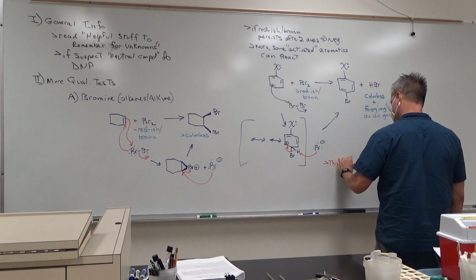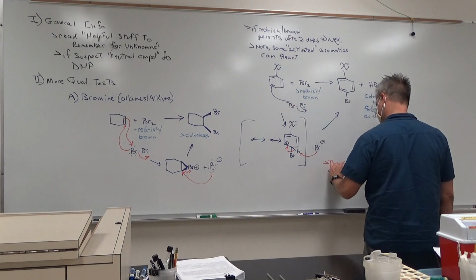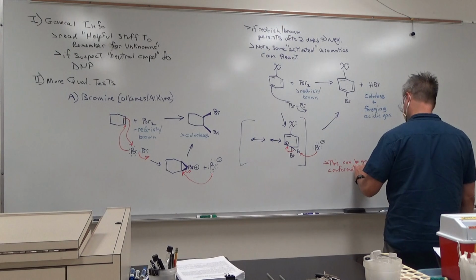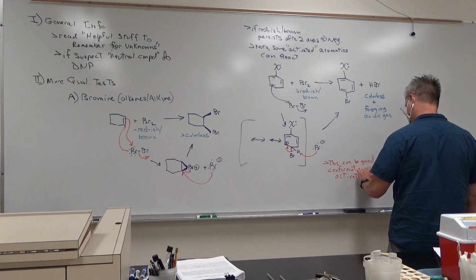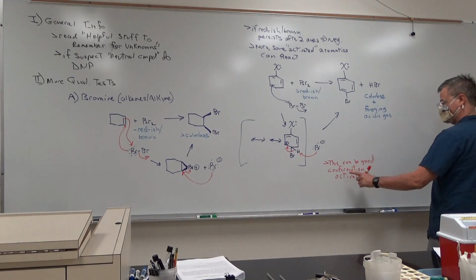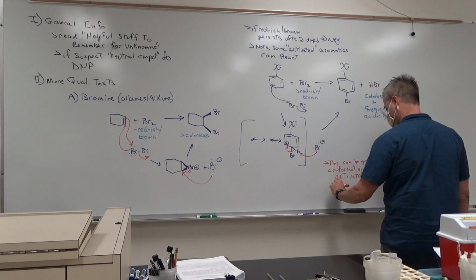This can be good confirmation for an activated aromatic. AR is an abbreviation for aromatic. Can be good confirmation for an activated aromatic, okay?